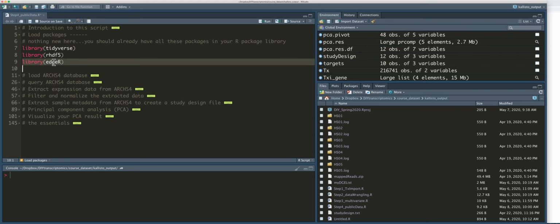So that's an important thing to recognize: in going through this exercise on finding and handling public data, it also provides an opportunity to move through some of the things we did in the last script. We're going to need to normalize. We're going to need to create a PCA analysis and then use ggplot to graph that. So we really have this dual purpose today of trying to learn something new, but also getting a refresher on what we did in the last script.